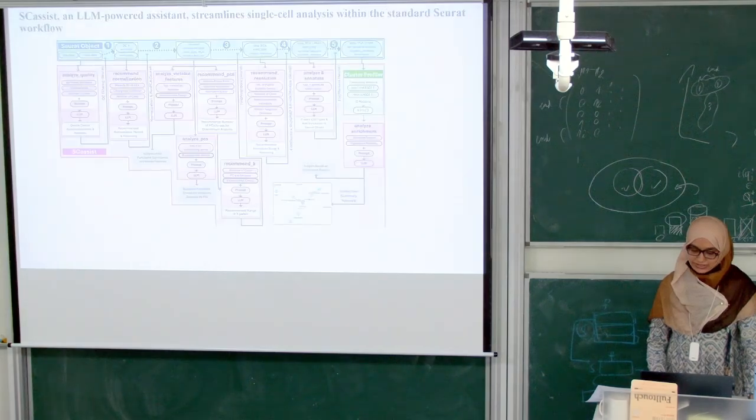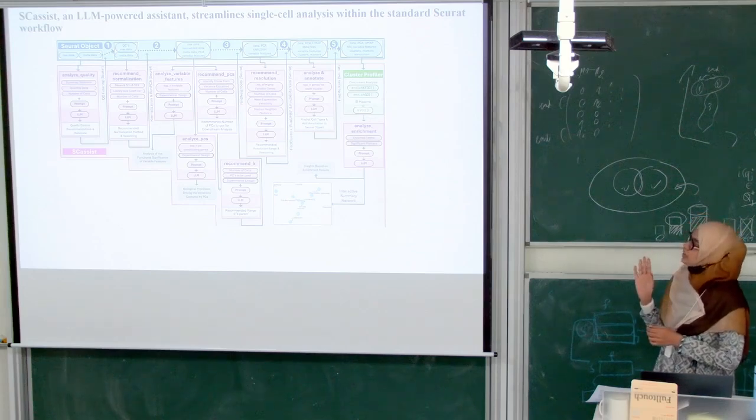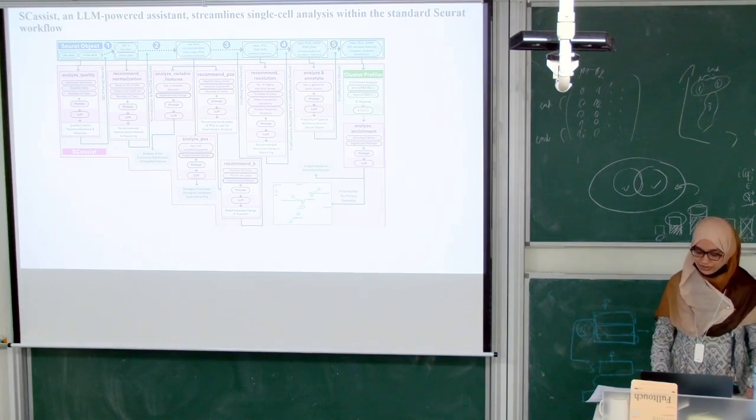So basically, what is SingleCellAssist? It is an LLM-powered assistant that streamlines single-cell analysis within the standard Seurat workflows. The Seurat workflow is basically an R-based workflow that is used for single-cell analysis. So they simply integrate the LLMs into this workflow.